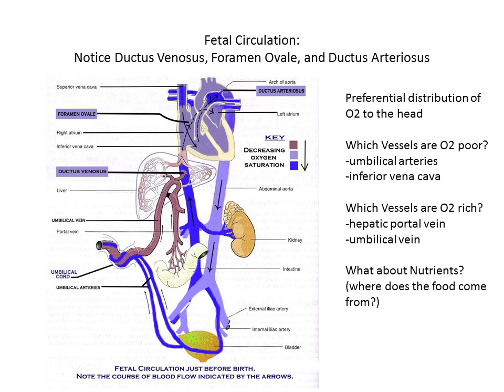So there's two holes in the aorta too. So there's some pressure issues there, but whatever. Ductus venosus is completely separate. Ductus venosus is down here. This structure is intended to help us skip the liver altogether. Liver doesn't need all that rich oxygenated blood, nutrient blood, but the brain, way downstream, really does.